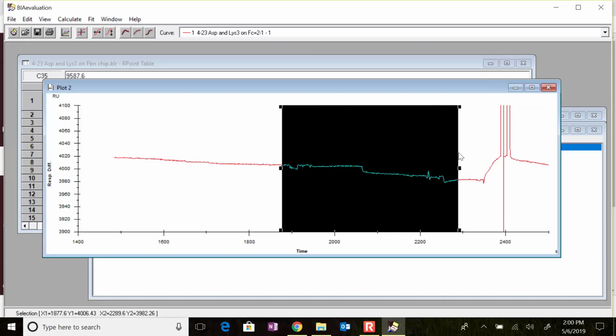The one thing to remember about the blanks, though, is that you did your 40 microliters per minute, and then you do a 60 microliter injection, 180-second wait. So if I look right here, I can see that this is sort of the association phase, and then it has sort of a dissociation phase right there. And the one thing that you can always look for is the little wash signature, you know? Right there, this is what's doing wash, and then it got back to baseline, and then we did our next injection.